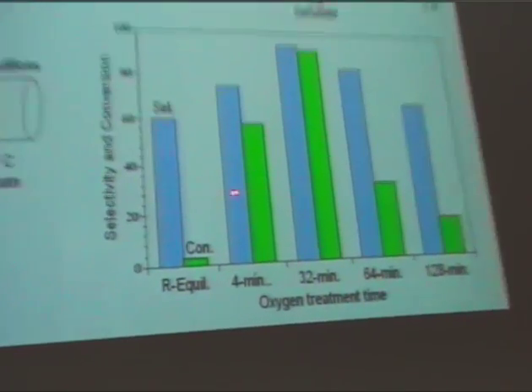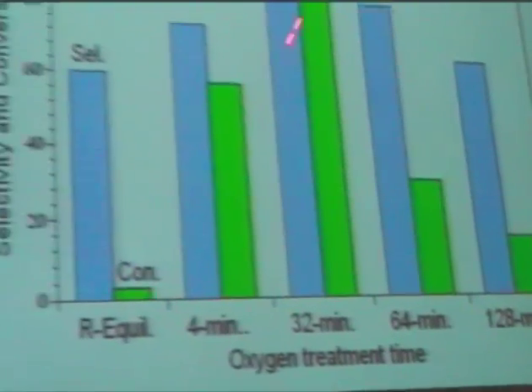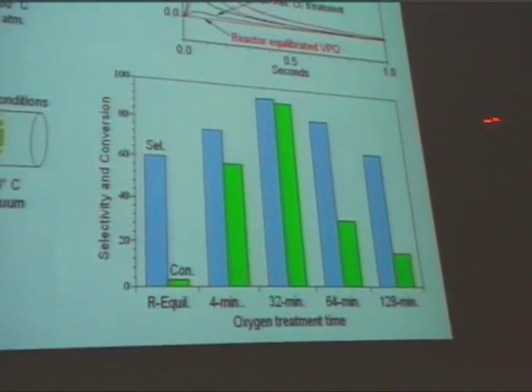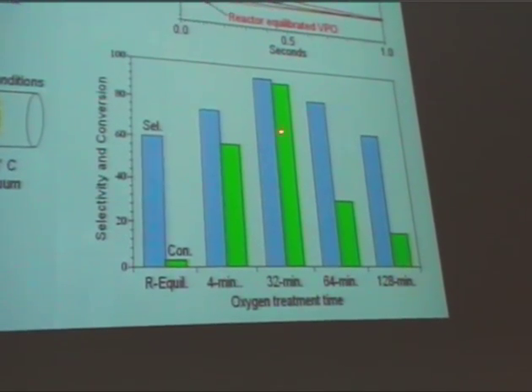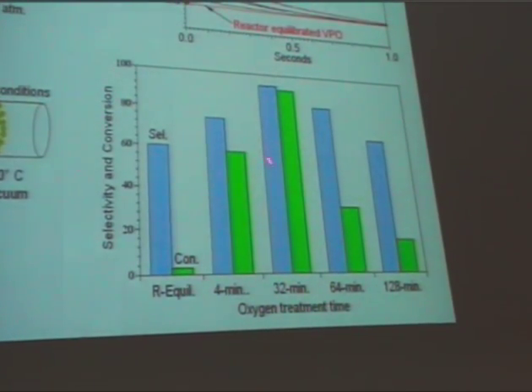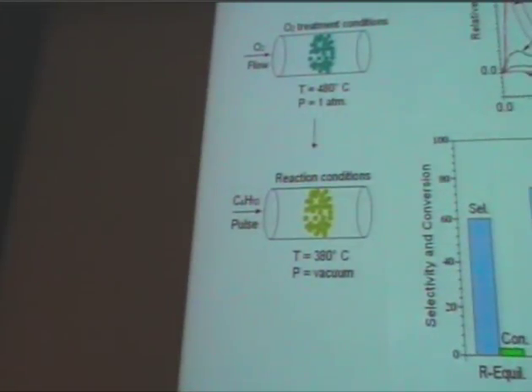We have a special 32 minutes of oxygen treatment time. We have optimal selectivity. And all catalysis experts and specialists know there is an optimum in catalyst treatment. We have to find this optimal treatment, and we have to find optimal reacting conditions.